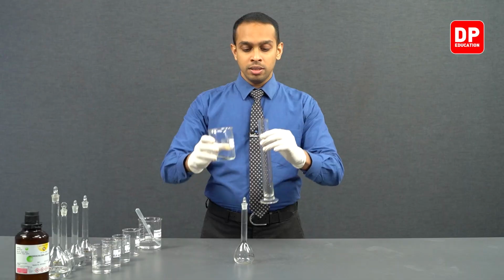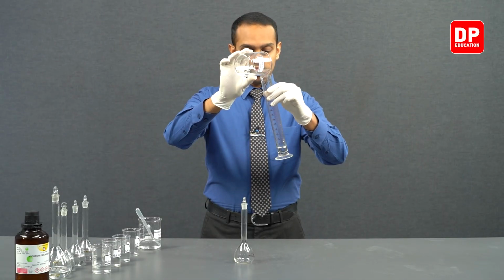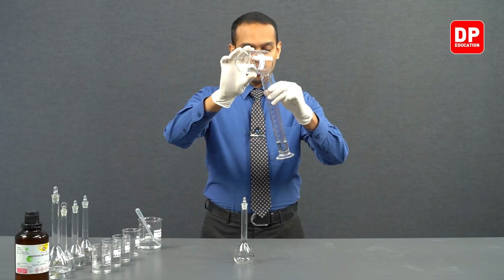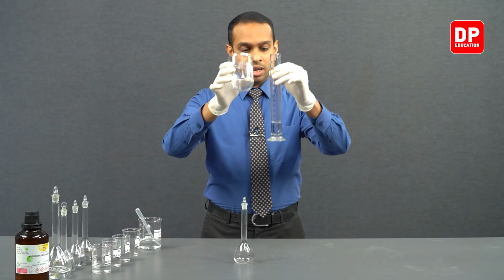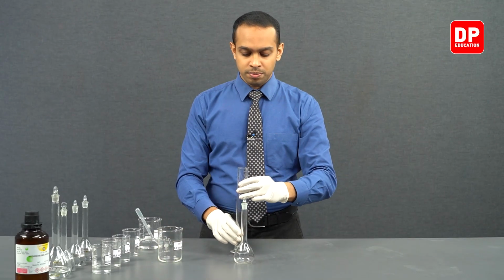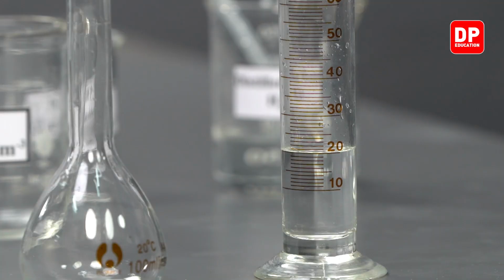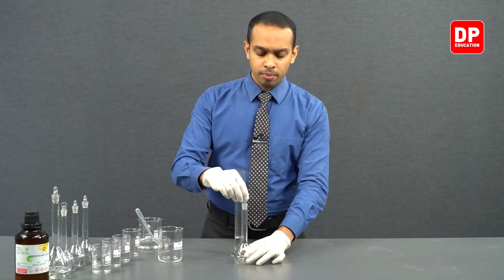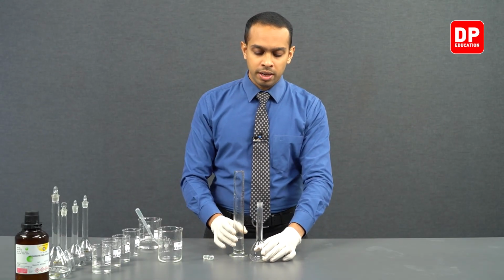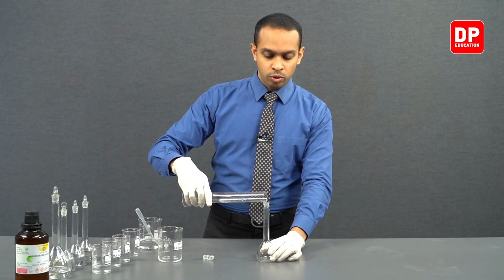So let's measure 20 milliliters of 1 mole per decimeter cubed concentrated HCl. We have measured exactly 20 milliliters of 1 mole per decimeter cubed concentrated HCl. We can transfer that into this volumetric flask.